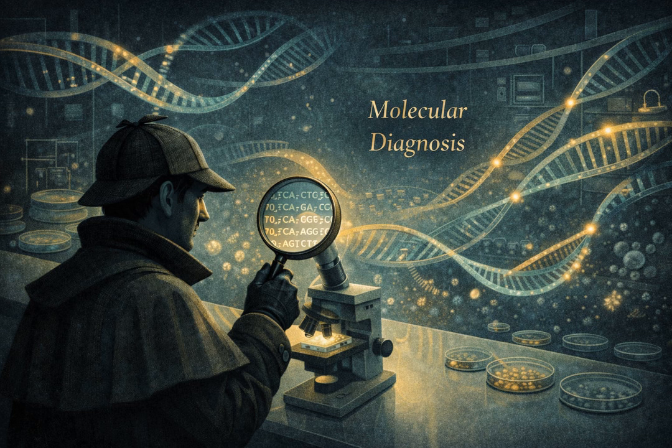And finally, the one that has really become the modern standard in most labs, real-time PCR, which is also known as qPCR, for quantitative PCR. Right. So in the, let's call them the old days of the 90s, after you finished your 30 cycles of PCR, you had to do a whole other step. You had to take the tube, open it up, pipette out the liquid, and load it onto an agarose gel. And then run electricity through the gel to see if you got a band of the right size. Exactly. It was slow, it was messy, and it was a huge source of problems.